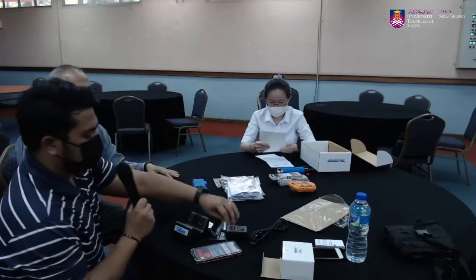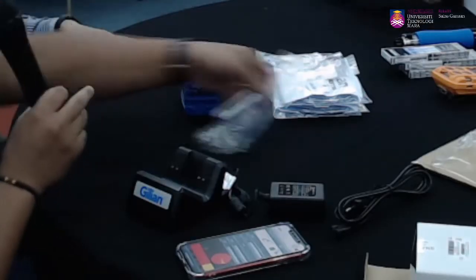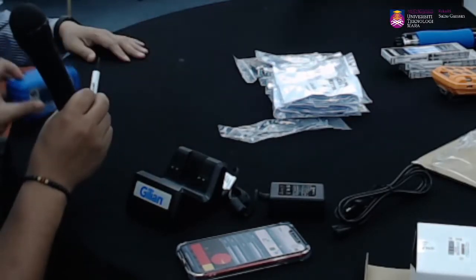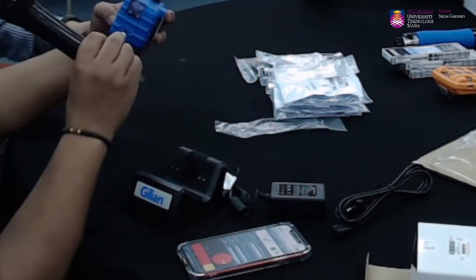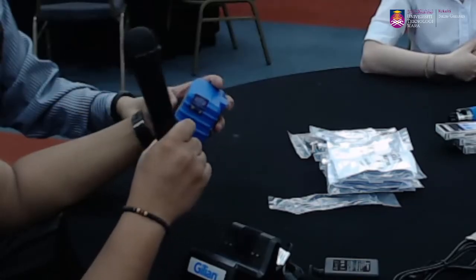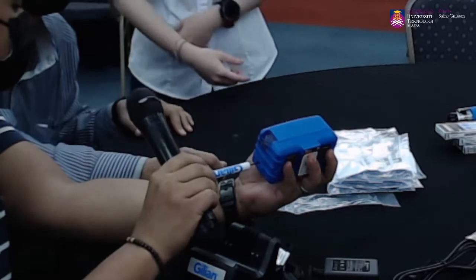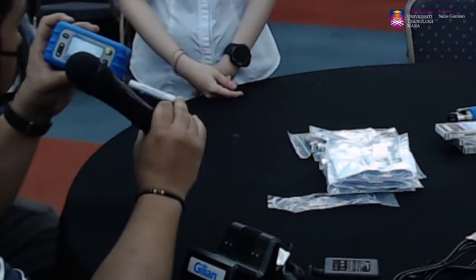Okay. So contohnya kalau nak gunakan this screwdriver, nak tahu kat mana kita nak slotkan kita punya screw ni, is that bahagian tepi ni. Bahagian tepi ada hole bawah ni kan, dekat sebelah filter ni. So kita just slotkan masuk dan kita pusing. So kalau contohnya bila kita pusing, kita nampak dekat bahagian screen ni dia tukar kepada low. Tadi high kan, so bila saya dah pusing dia tulis low. Means daripada sini kita tahu yang dia dah tukar flow rate dia.